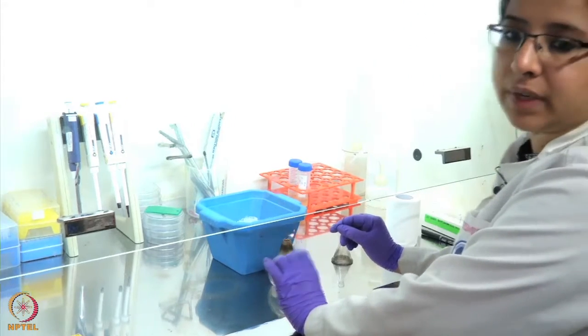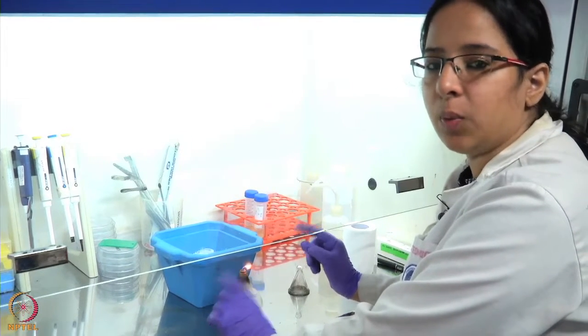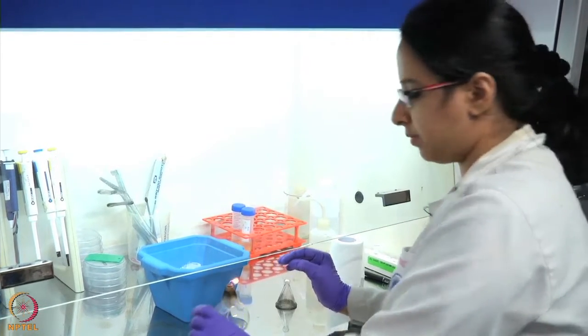So we have our competent cells, which are the host cells in which we will introduce our recombinant molecule. In one of the tubes, we'll add our recombinant molecule. In the other tube, we'll add our negative control water.